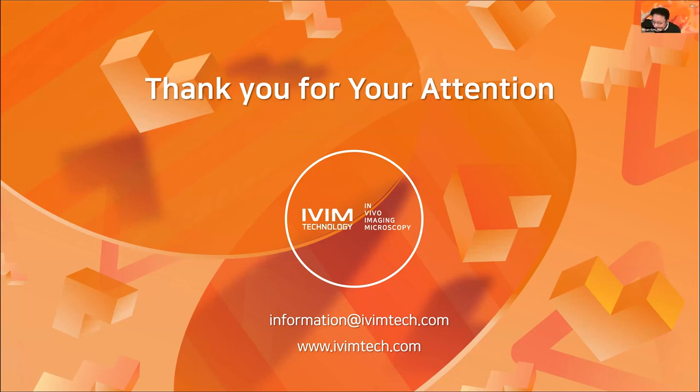Okay, so let me answer the questions in the Q&A. The first question is, is this iBeam only used for animals? At this moment, this system is designed mostly for animals, but we are developing another system for human use as well. It's not available, we haven't released it yet, but we are preparing another, more specialized system applicable to humans.